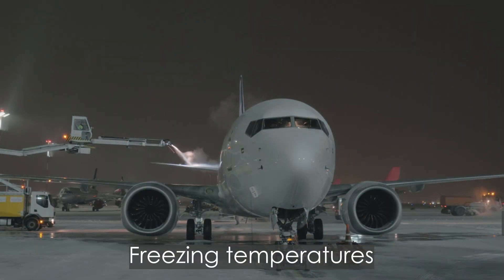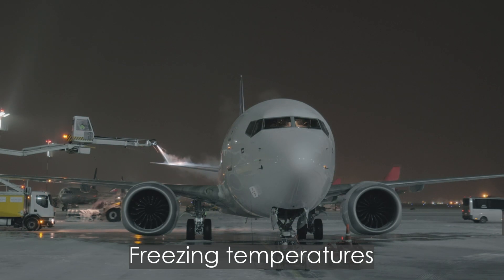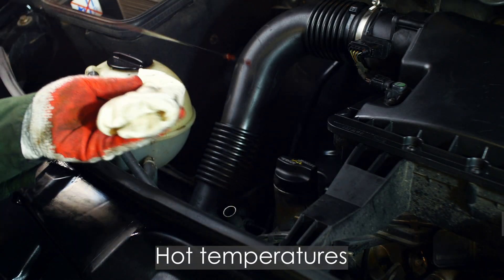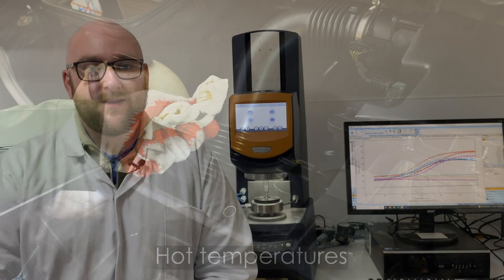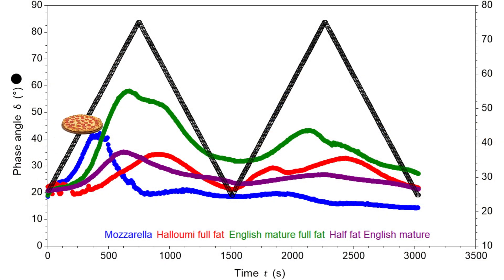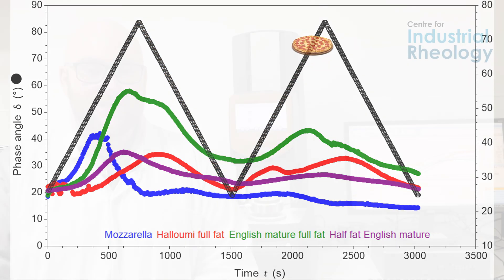That can be vital for something like an antifreeze that needs to perform very well at low temperatures, even down below freezing, or something like an engine oil which needs to get heated up and perform well at the temperatures in a high-performance sports car. It can even be great for cycling temperatures — something like the cheese on a pizza, which is pulled from the fridge, heated up in a pizza oven, pulled down in a fridge overnight, and then reheated in a microwave the next day.